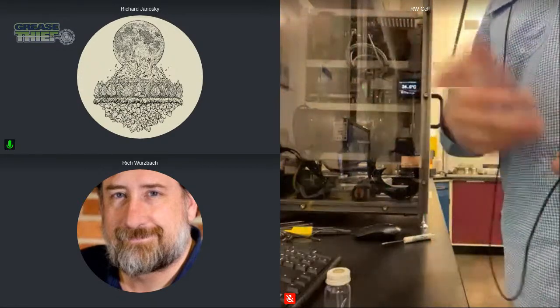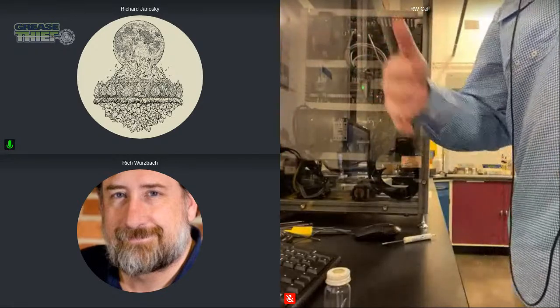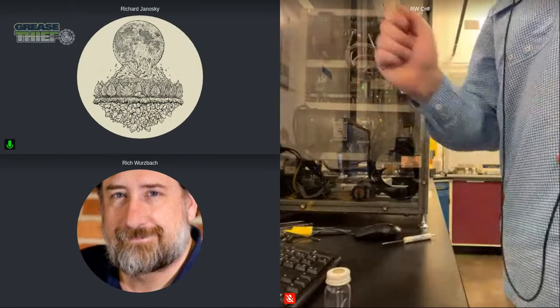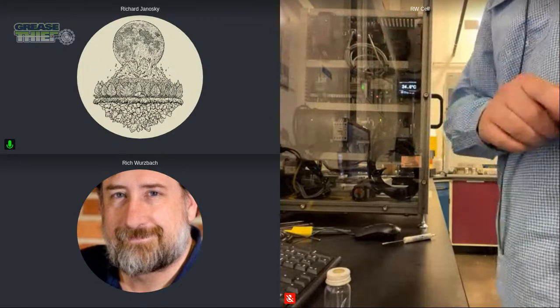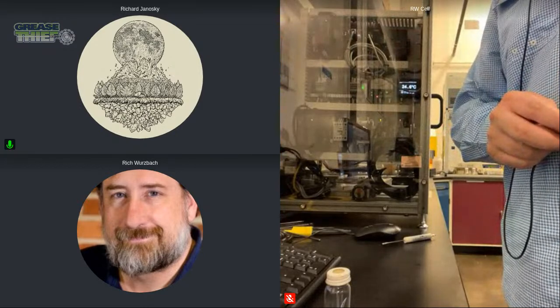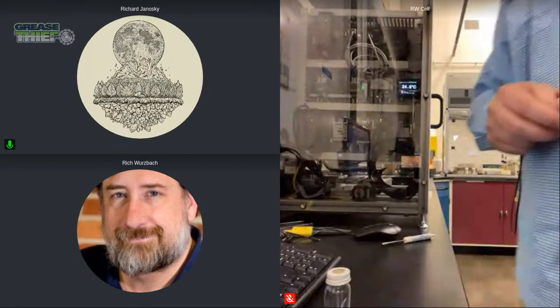Same thing for ruler. It's nice to be able to have a known amount of grease. If you have 2 full strips, pop those off, put them in solution, and then let them sit for a little bit. Use the vortexer to go ahead and mix those up and get a nice quick preparation there, right? Yeah, thank you. I lost my word for a second.